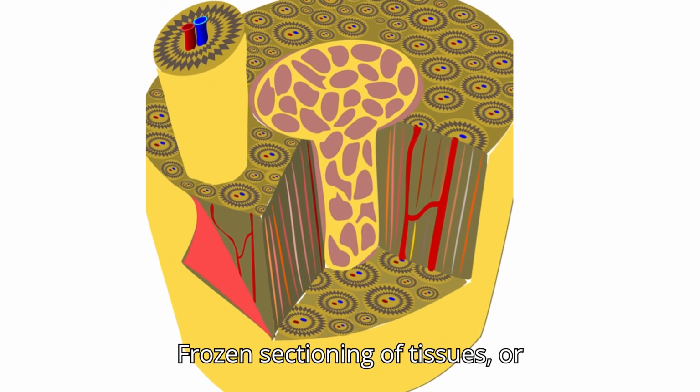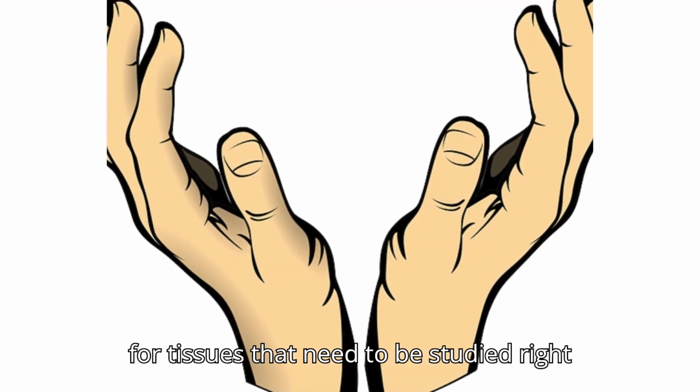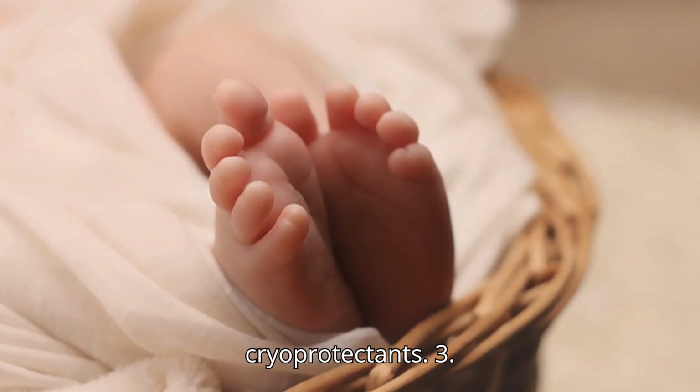Frozen sectioning of tissues, or cryosectioning, is an important procedure for tissues that need to be studied right away. Freezing can be achieved either in liquid nitrogen or with some cryoprotectants.